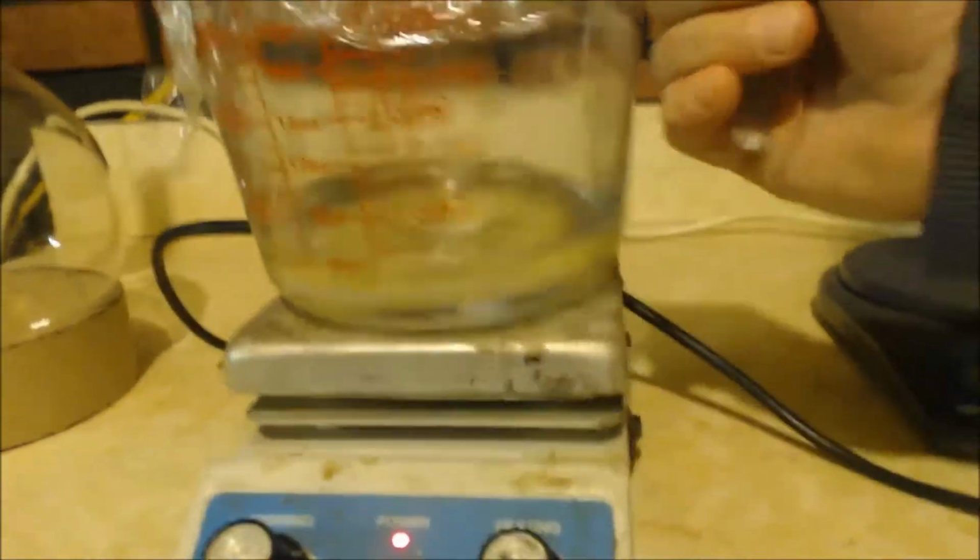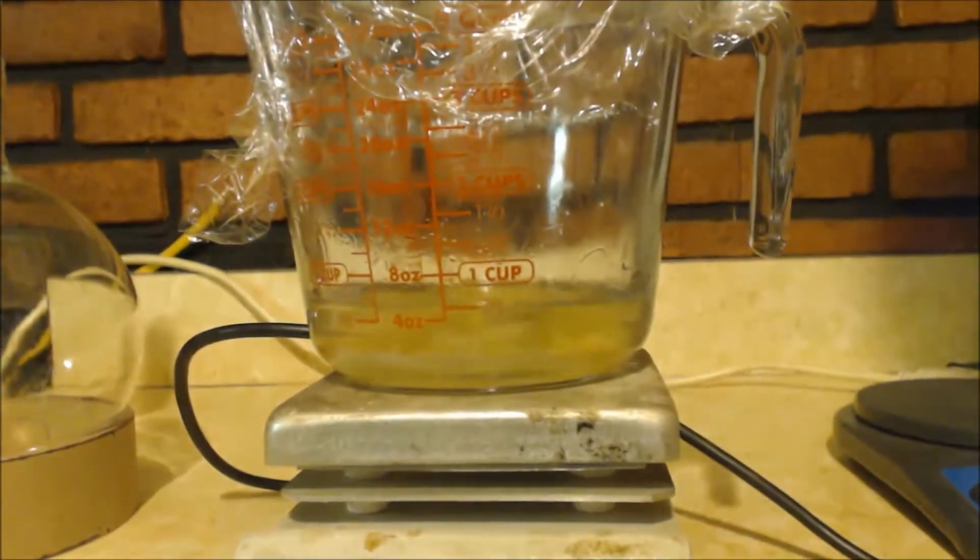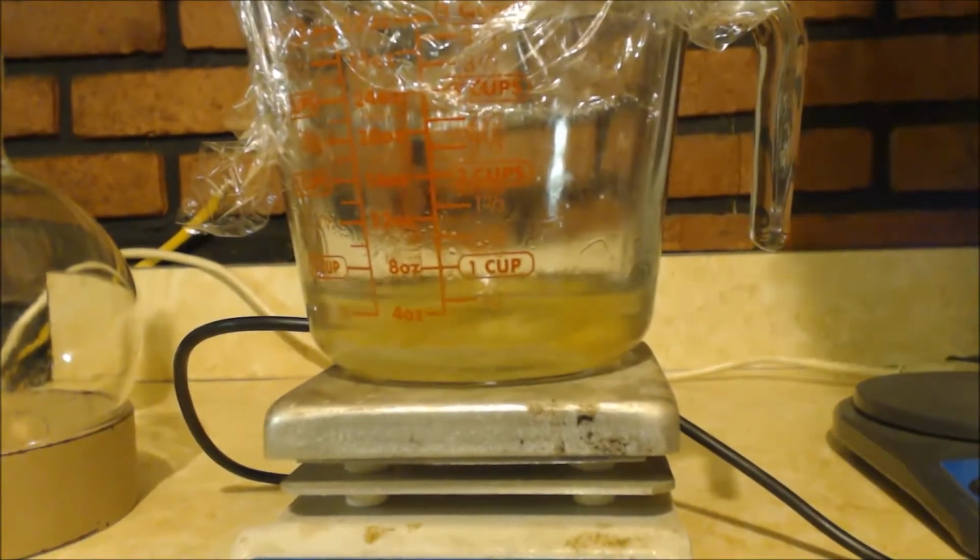That sodium hydroxide was totally white. I don't know if you can see it, but it's yellow now. You can't tell, but here maybe on the stove. Look at the stove background and then see how yellow it is? Before, it was perfectly white. So something's happening. So I'm going to let that stir up for a while and see what happens.